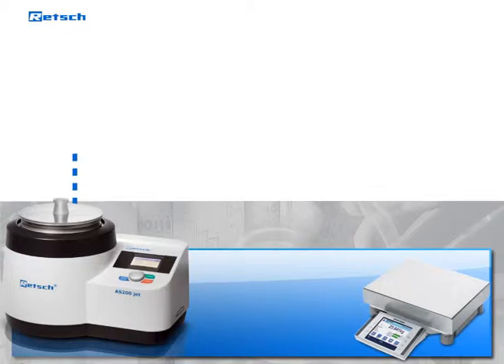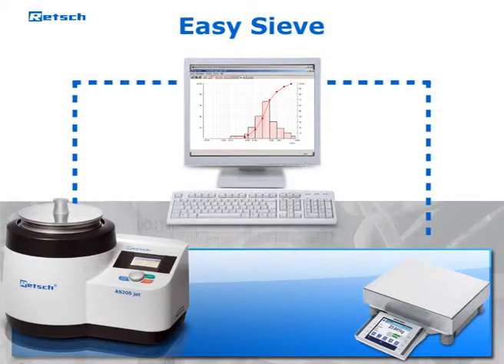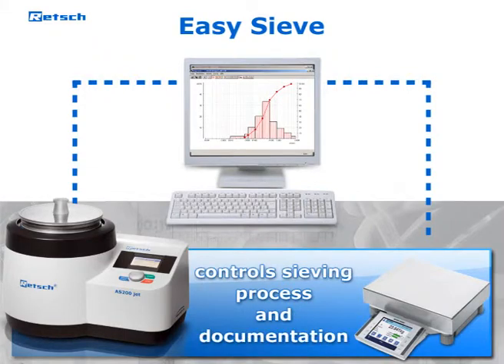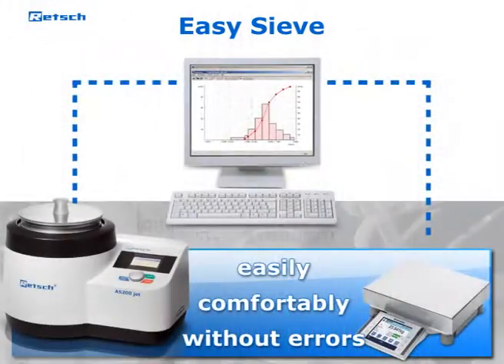Thanks to an integrated interface, the AS200 Jet can be controlled with the evaluation software EasySieve. This program allows to control the entire sieving process and the subsequent documentation easily, comfortably, and without errors.